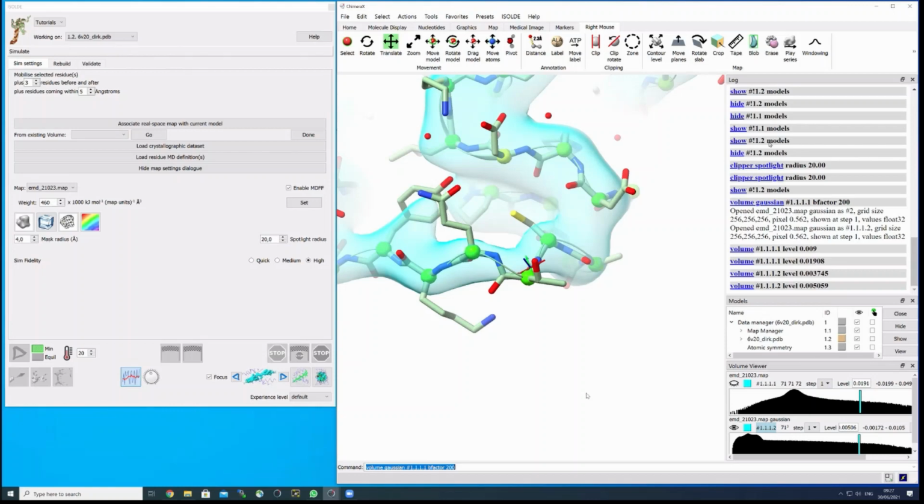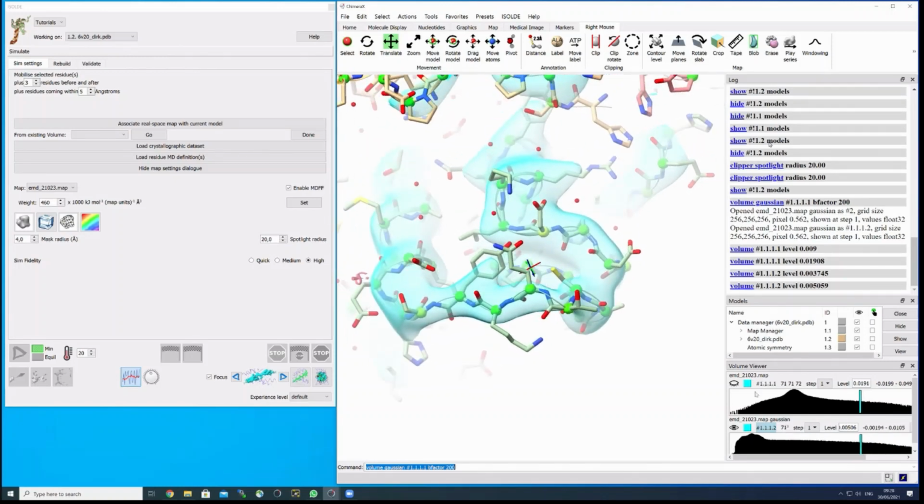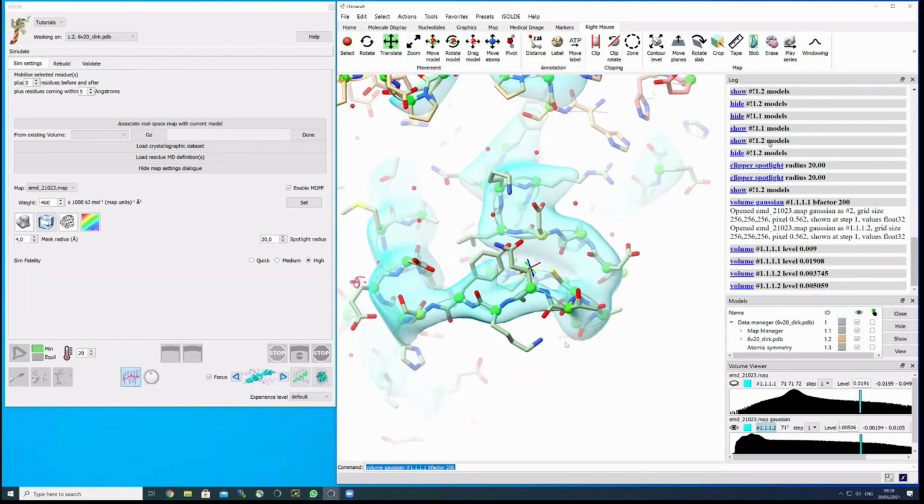So you can supply your own value to this. Sometimes it's good to have a very moderate B factor, which is only 10, 20, 30 or so, or minus 60. And then in Isolde you can supply your own B factor on top of it. And then I make 2-3 maps in addition to the one that I'm having, with higher B factors and with lower B factors. And I can use them all for the model building.